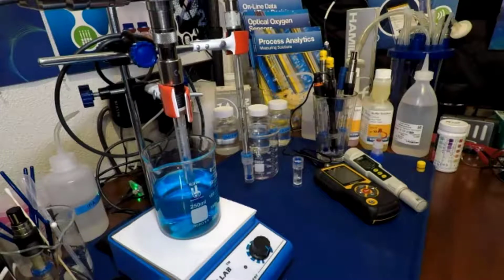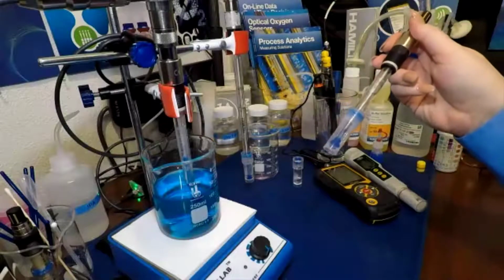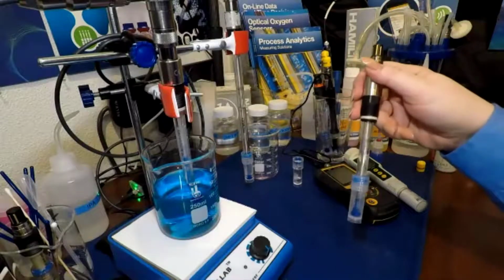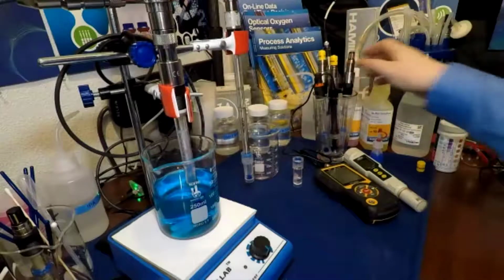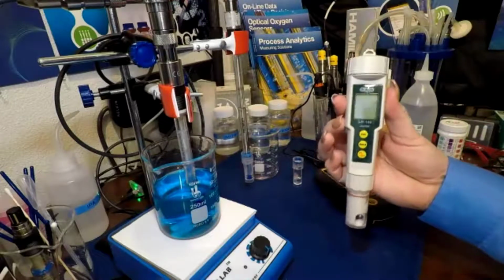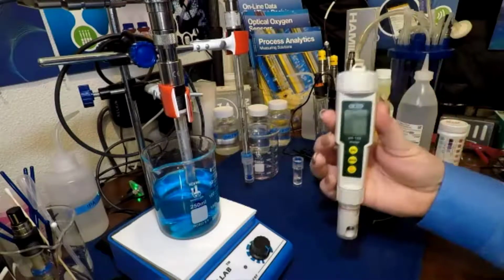The most common sensors, however, are what we call glass sensors. And these are what is used in bioprocess. I have a range of them here. You can actually see I've got one sitting in solution, but there are other sensors that you're going to see around. If you ever go to a lab in the real world and they give you a sensor like this in your lab, walk away. Just walk away.